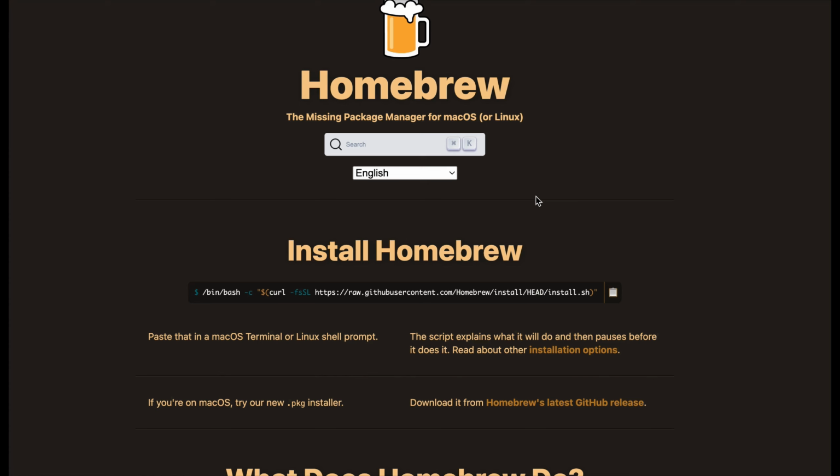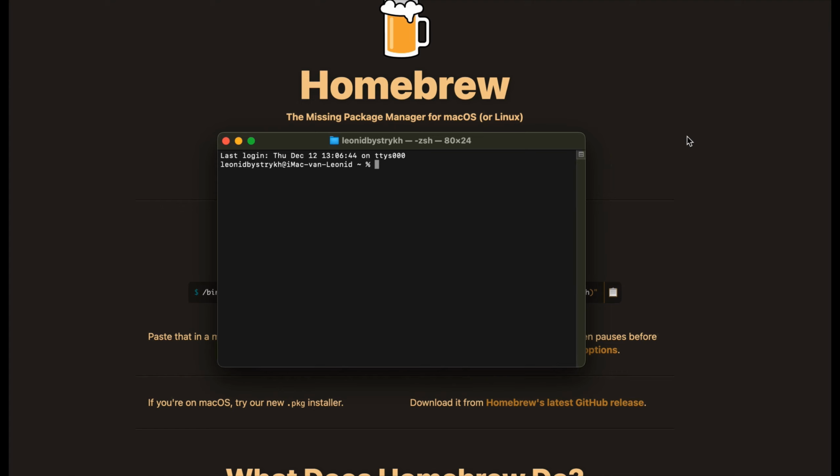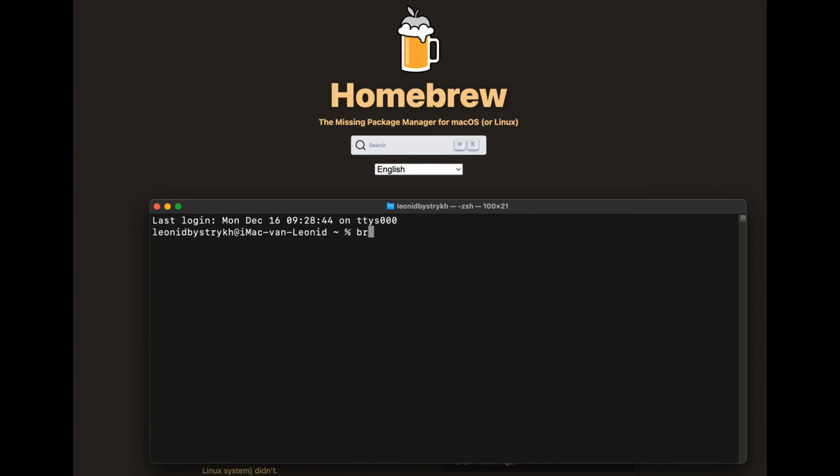The way to install it: you go to the Homebrew web page, copy this line, go to a command line, paste it here, and push enter and it will be installed. fastqc is also added to the Homebrew collection, and therefore when you say brew install fastqc, you will see the line auto updating Homebrew, then some report on updates, and then you see the installation of fastqc.